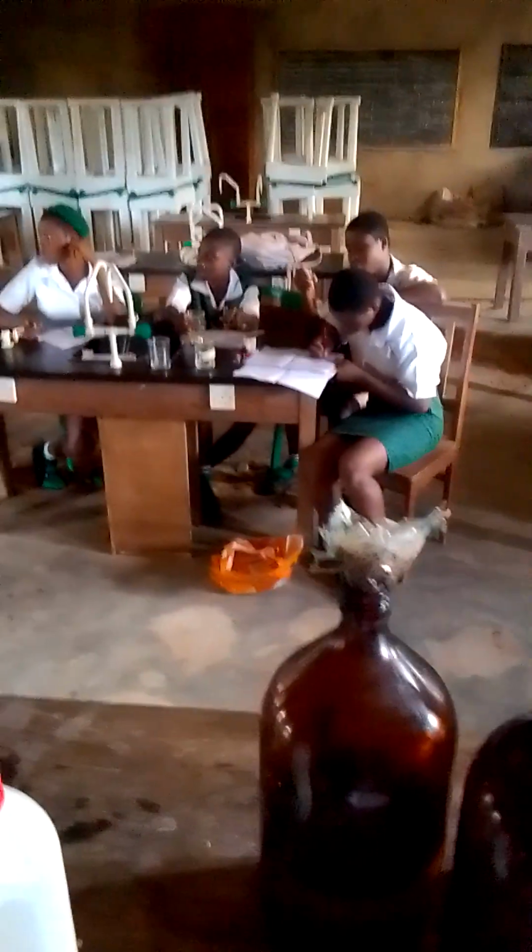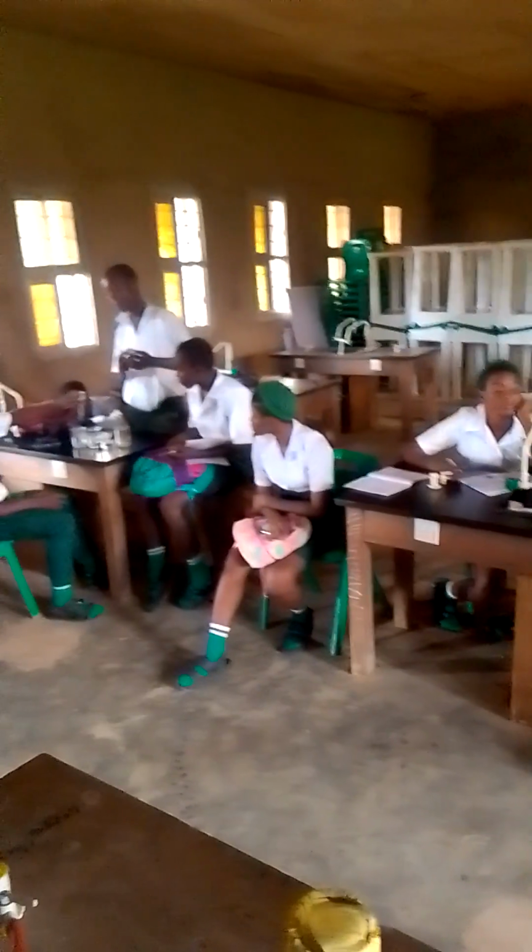You have the other test tube now. So now look for the acidic radical. Now, the instruction is: solution D plus barium chloride plus hydrochloric acid. Let's see how it will be. Yes, that one is solution D, that original one. Pour it inside that test tube.